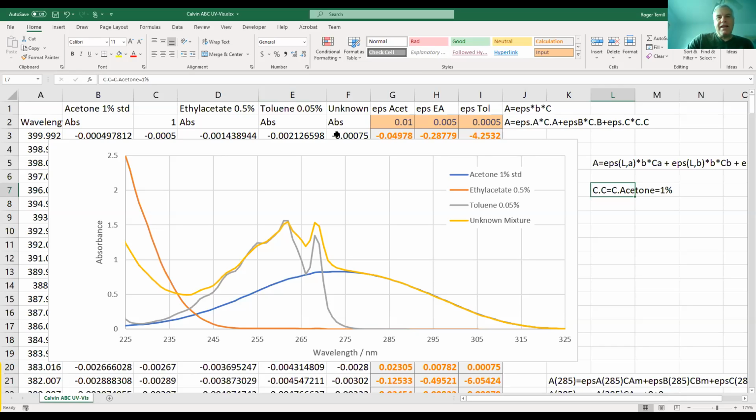So really, does the concentration depend on the wavelength that you observe at? Yeah. Okay, so it does. So if you look at a wavelength where there's no absorbance, can you say there's zero concentration? Oh, sorry. No. Yeah, exactly, right. So the concentration has nothing to do with this.